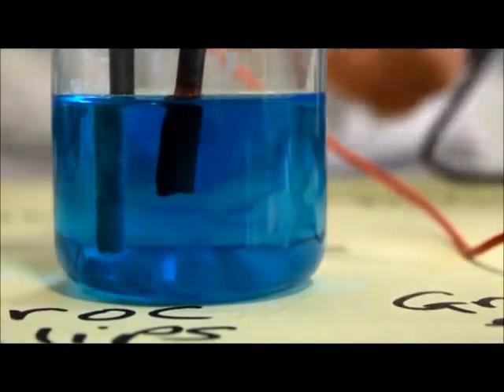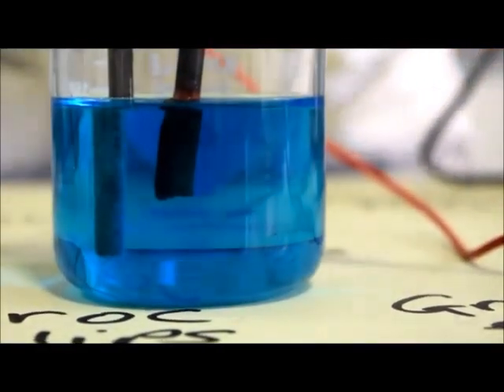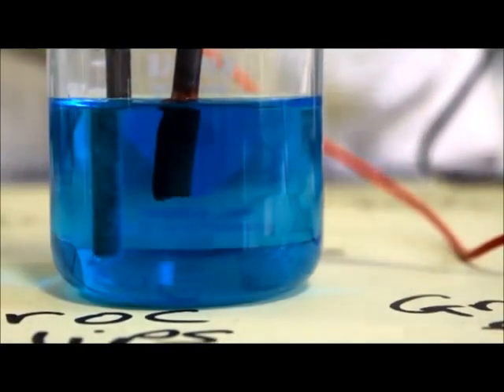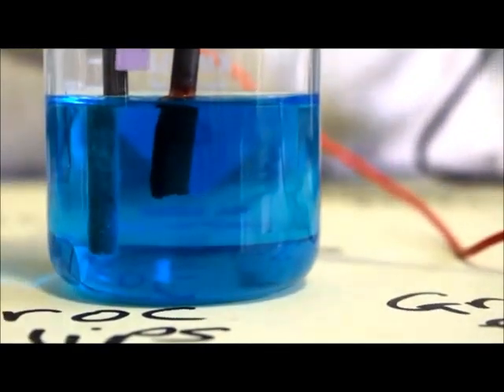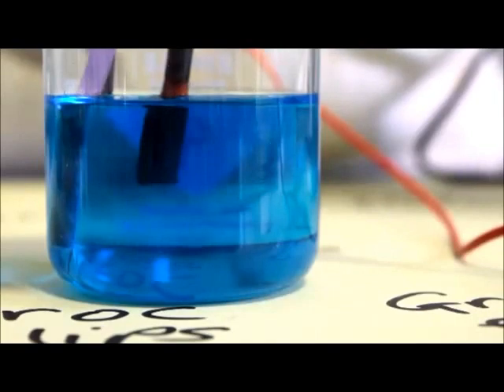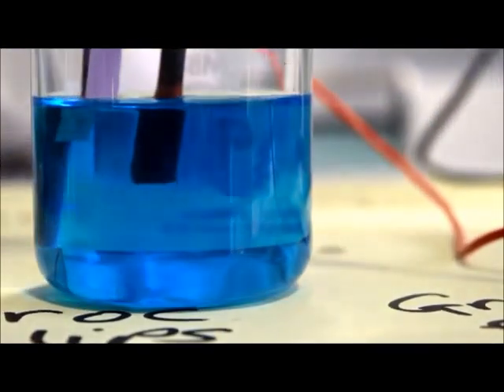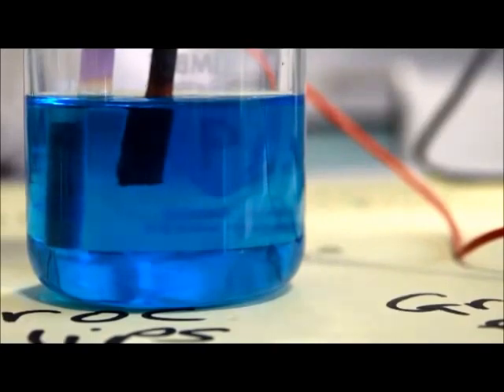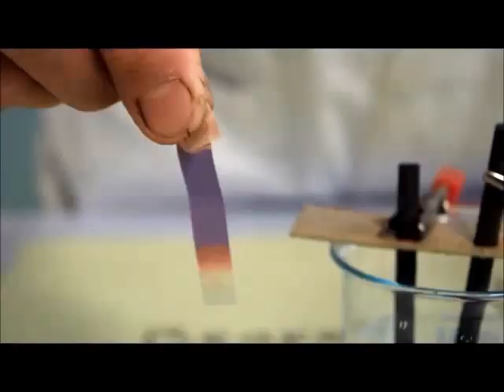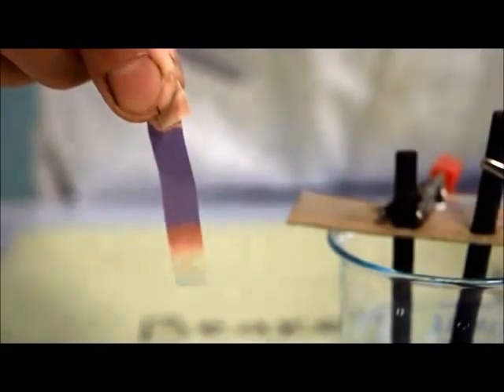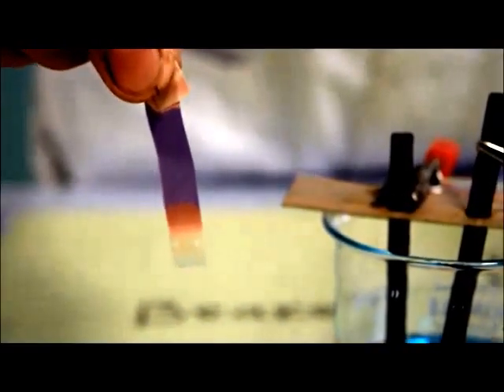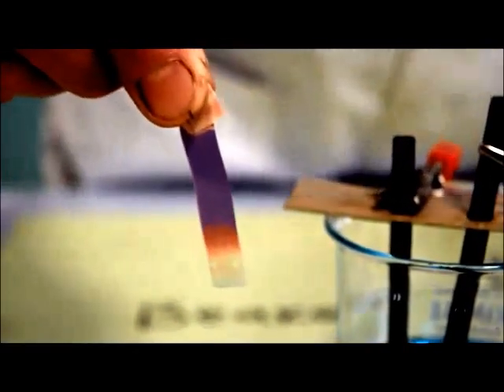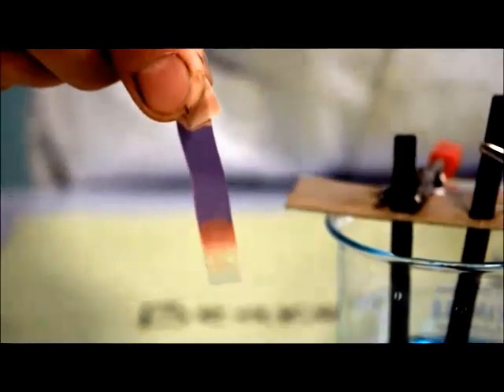When you turn this on, you will see bubbles forming at the positive electrode. If you lower blue litmus paper next to the bubbles—make sure you're going under the solution—the litmus turns white. You can see the litmus paper has turned white, and that's because the electrode has produced chlorine gas.